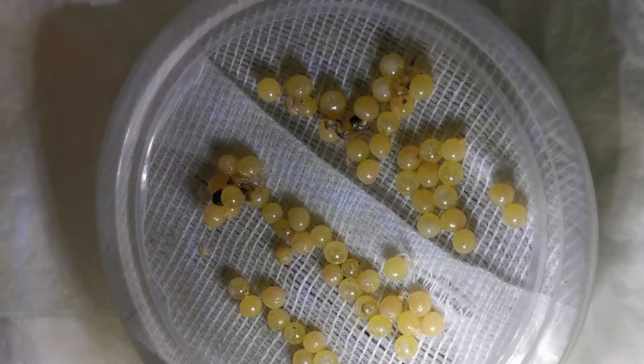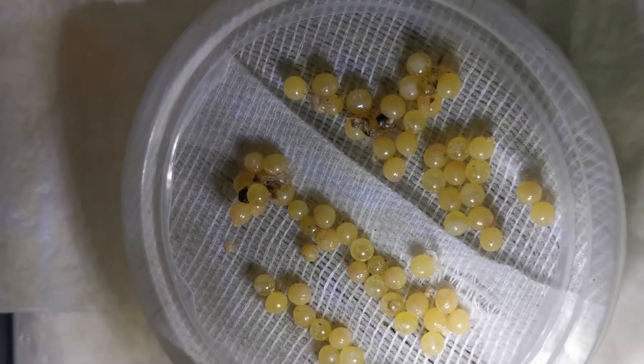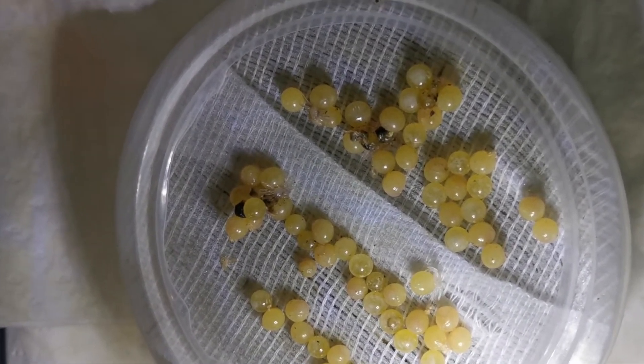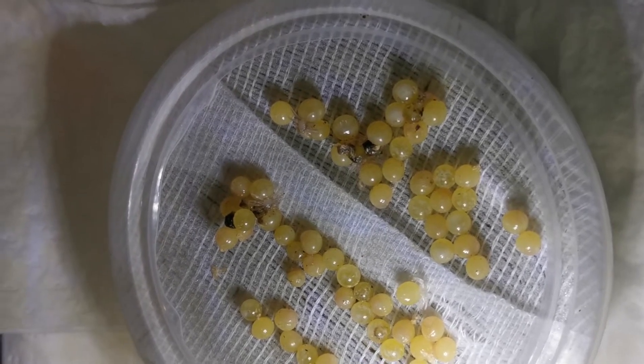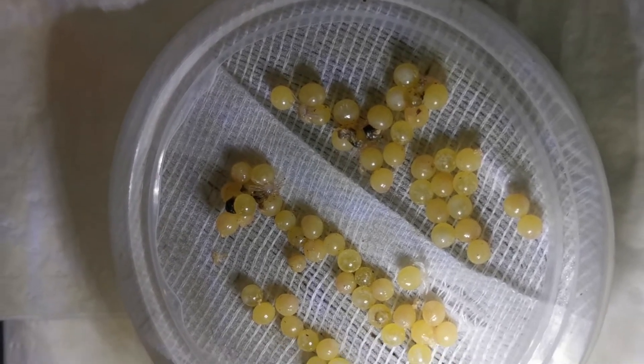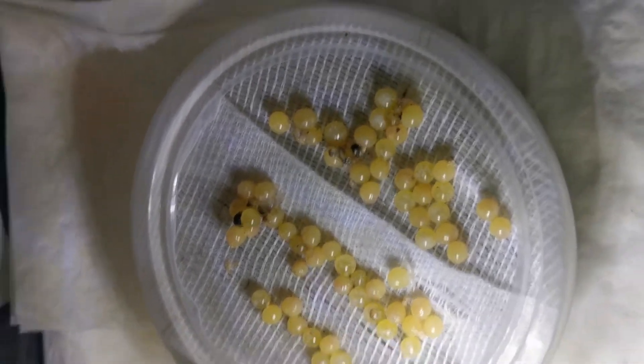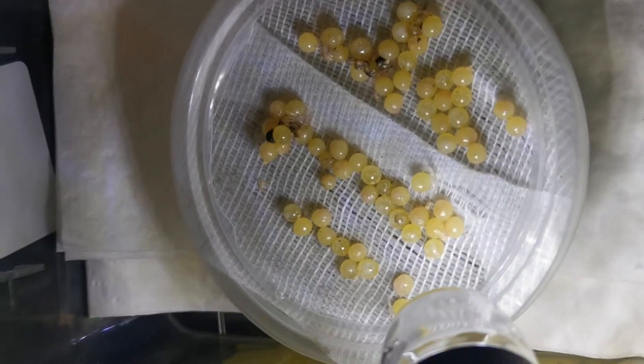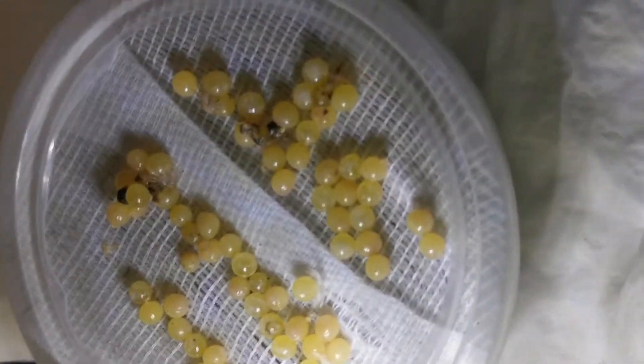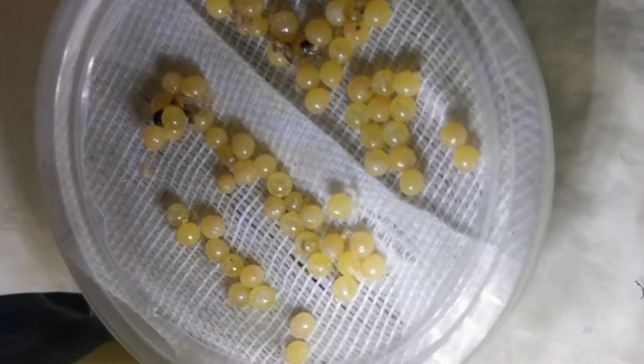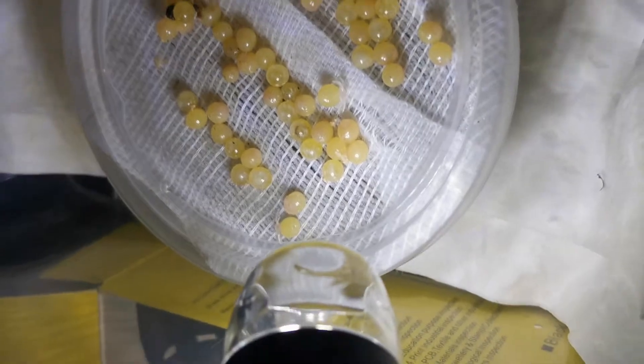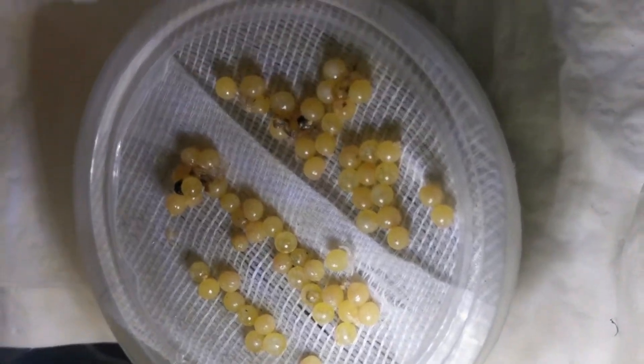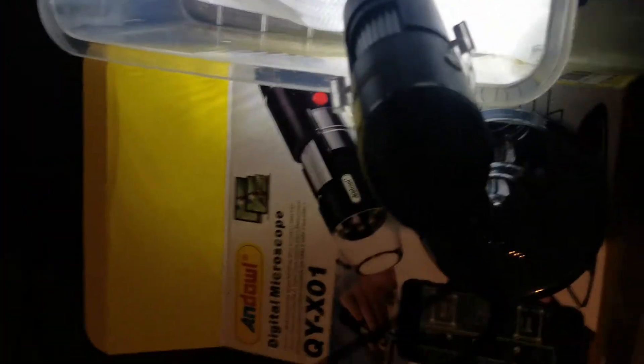Hey guys, okay so today I'm going to show you my new toy. I actually bought it for my son, but now I'm playing around with it. It's a digital microscope, just a small handheld thing you can get anywhere from ten to a hundred bucks, but I think it's quite impressive, especially for the price.